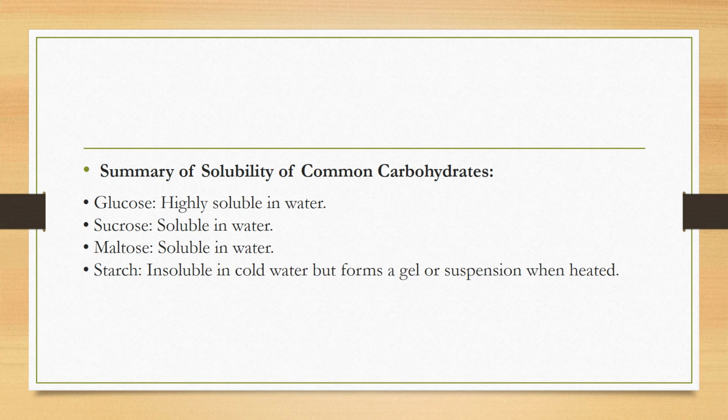The summary of these results. Summary of solubility of common carbohydrates which are tested. Glucose, highly soluble in water. Sucrose and maltose, soluble in water. But starch, insoluble in cold water, but forms a gel or suspension when heated.